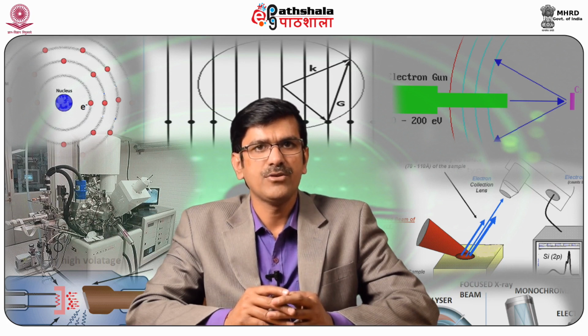Make a test XPS recording for a well-known material and verify the obtained spectral parameters with published data.